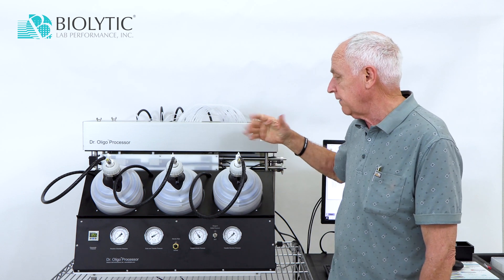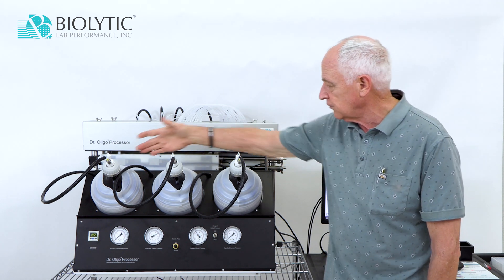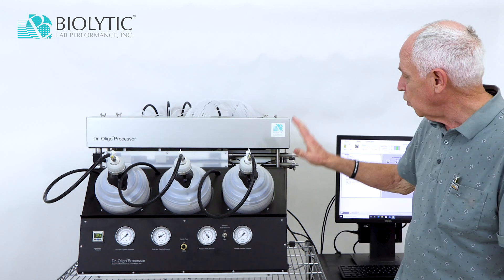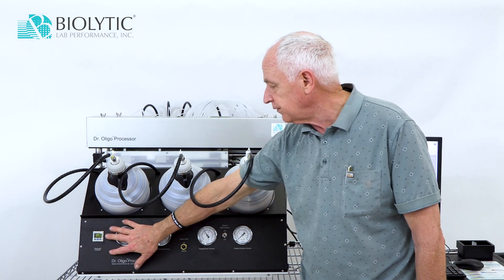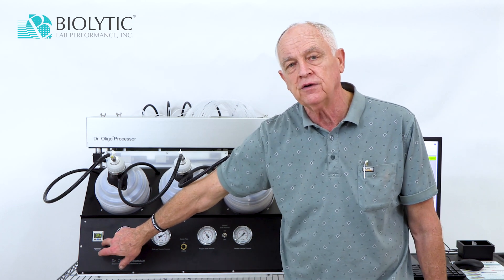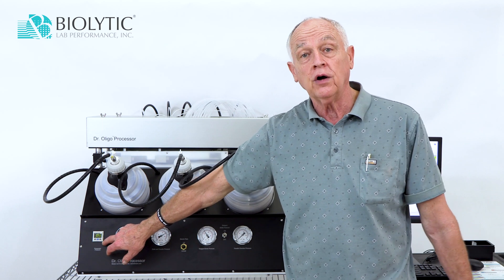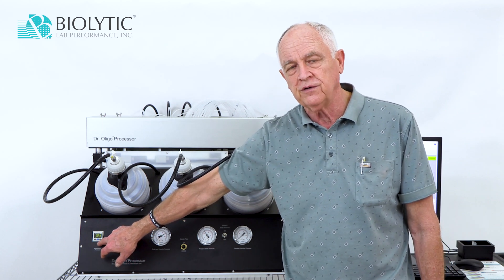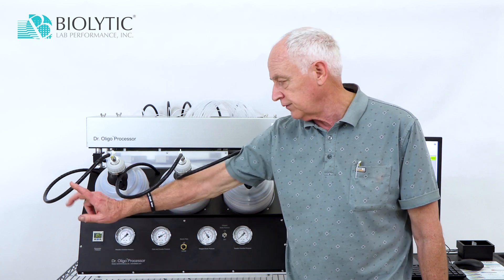In order to perform these various processes, we have bottles of reagents on the instrument — three in the front, five in the back, a total of eight. On the front here for controls, on the left-hand side we have the digital pressure gauge that indicates, number one, that the instrument is on if it's lit, and number two, what the pressure is that's coming into the instrument from the outside.